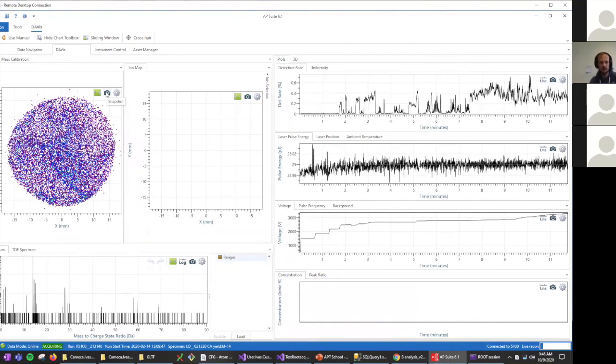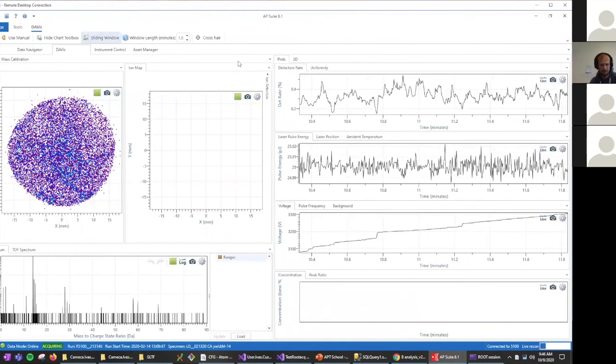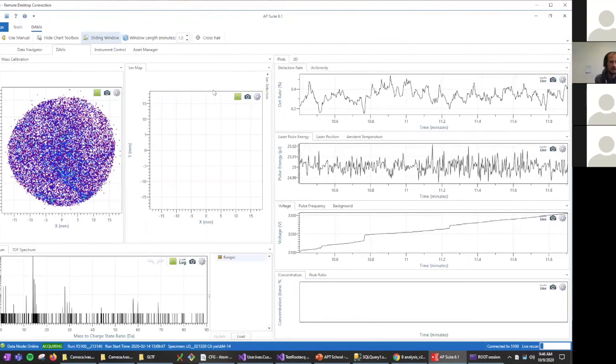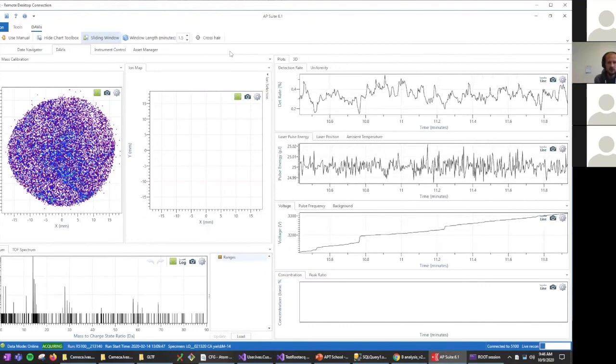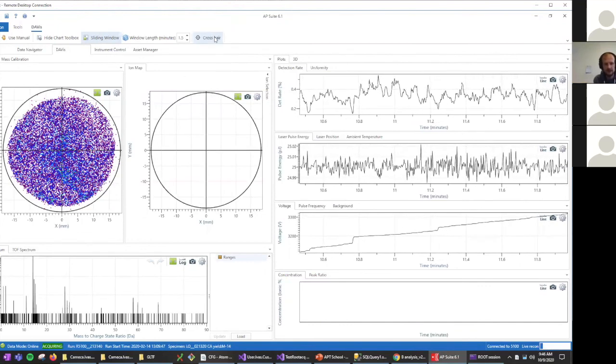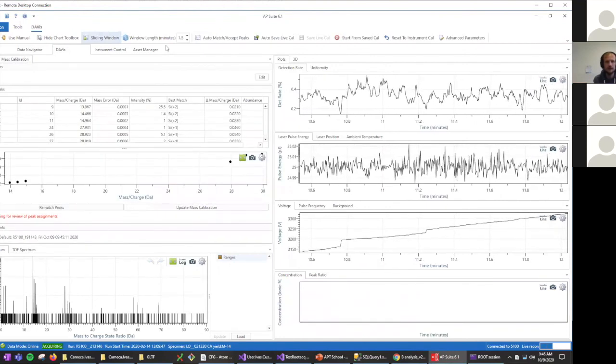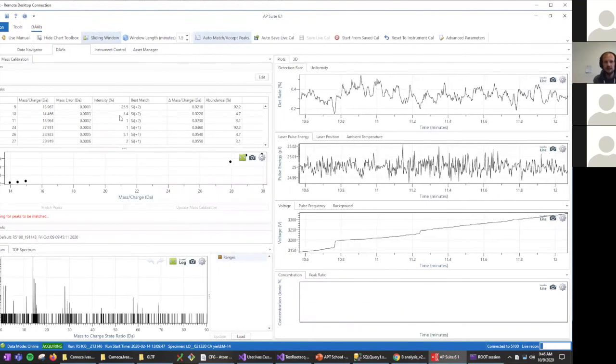But there's always this conflict, and how to resolve this best. I would say what would help the community most is documentation, examples, making these examples open as best as possible, and making interfaces open.